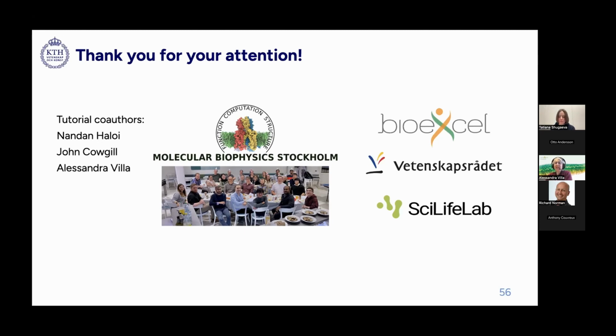Thank you, Tatiana. Now I just jump around with a question because we are almost done, so I think I take the last question. There is an anonymous attendee who has asked: may I ask how you compute the artificial density of unaligned atoms before the similarity gradient evaluation? Sorry, I'm not sure that you covered this.